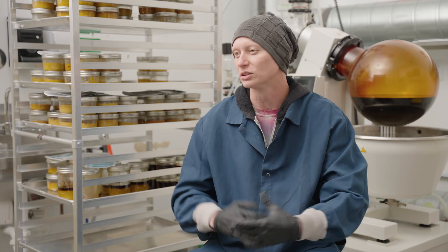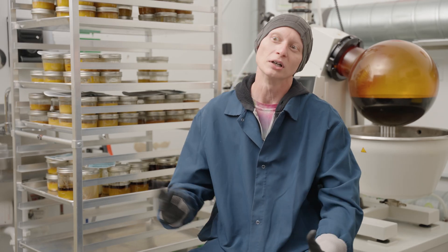I'm Andrew Byrne. I'm the laboratory director here at Proper Cannabis. Today we're going to go out and take a look at some of the concentrates and what we're making and just look at the processes. So why don't we go take a look?